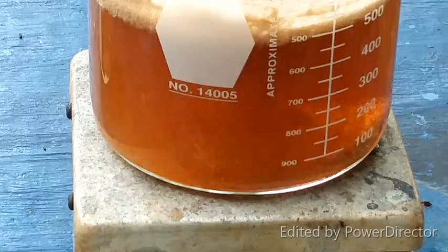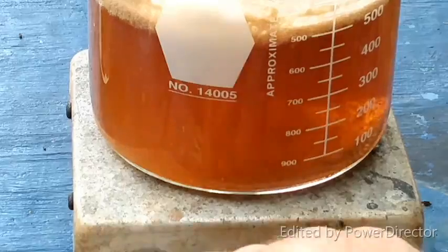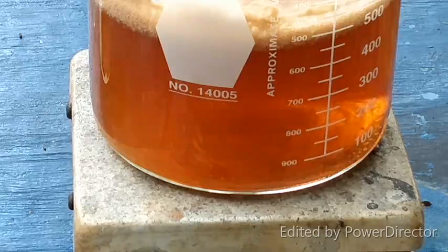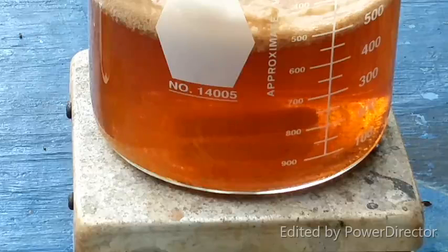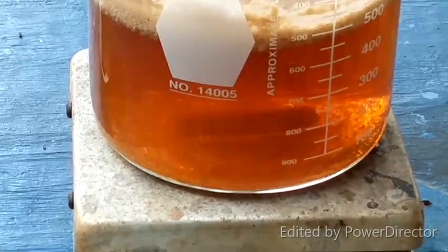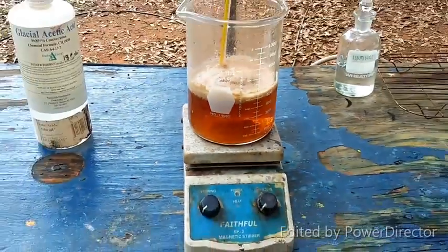That is pretty damn cool. Okay, what is going on there? Interesting. Well, we've definitely got a lot of solid in there. Although, this foam is weird.